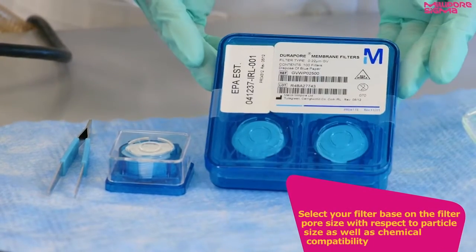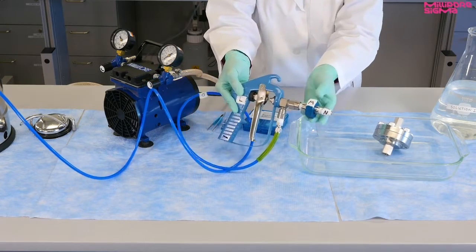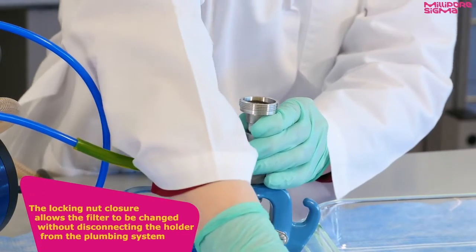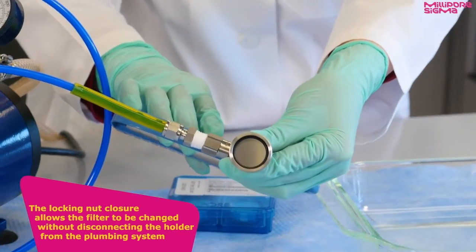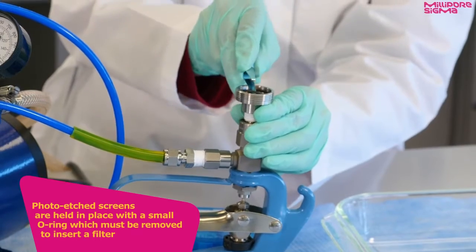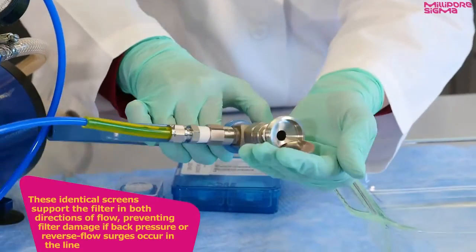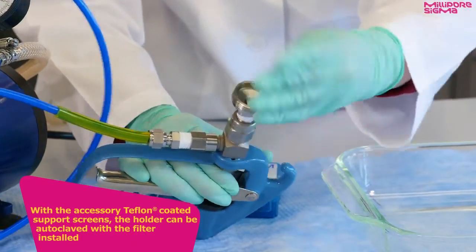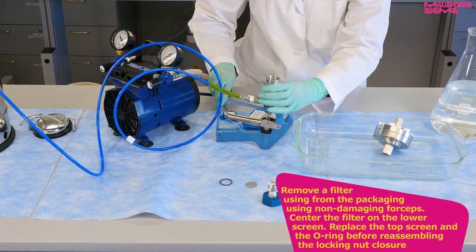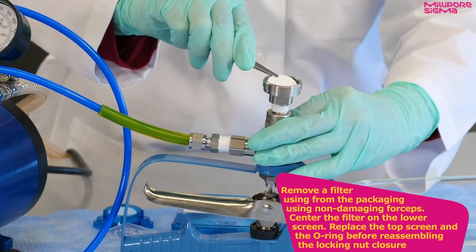Select your filter based on the filter pore size with respect to particle size as well as chemical compatibility. The locking nut closure allows the filter to be changed without disconnecting the holder from the plumbing system. Photo etched screens are held in place with a small O-ring, which must be removed to insert a filter. These identical screens support the filter in both directions of flow, preventing filter damage if back pressure or reverse flow surges occur in the line. With the accessory Teflon-coated support screens, the holder can be autoclaved with a filter installed. Remove a filter from the packaging using non-damaging forceps, center the filter on the lower screen, then replace the top screen and the O-ring before reassembling the locking nut closure.